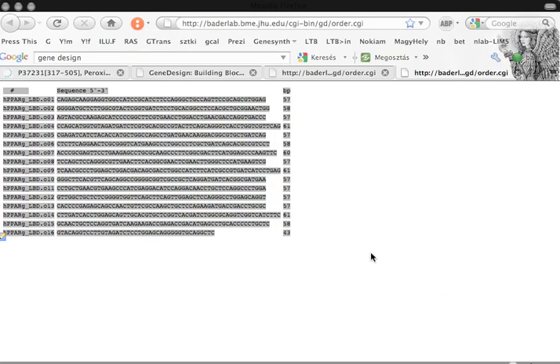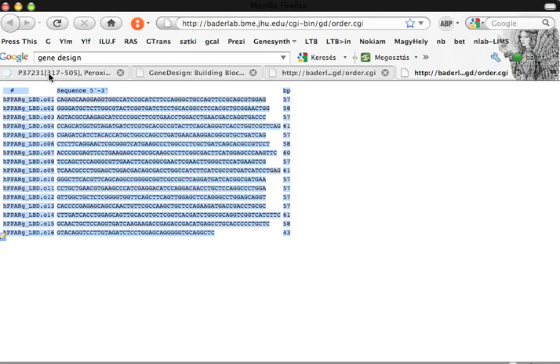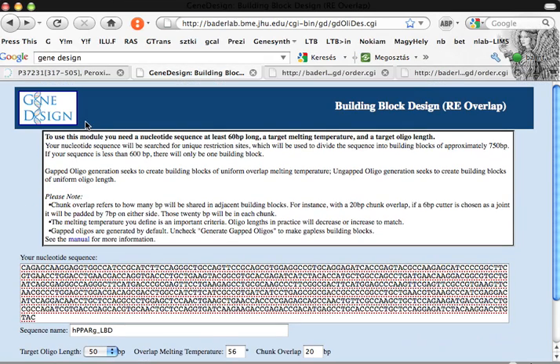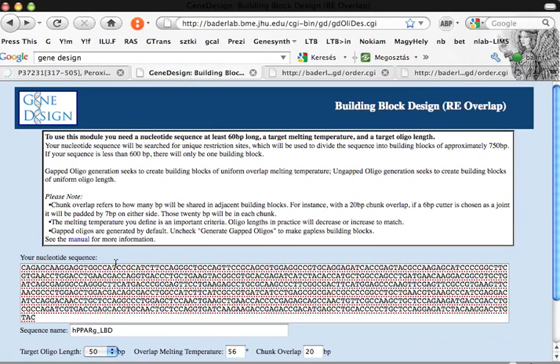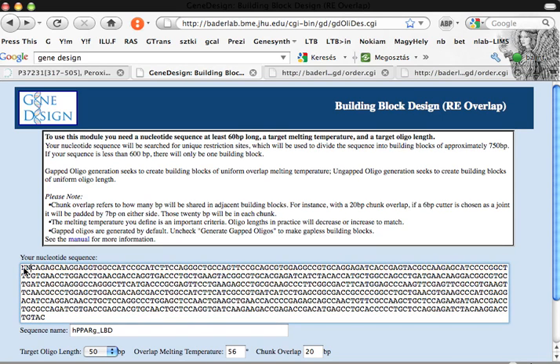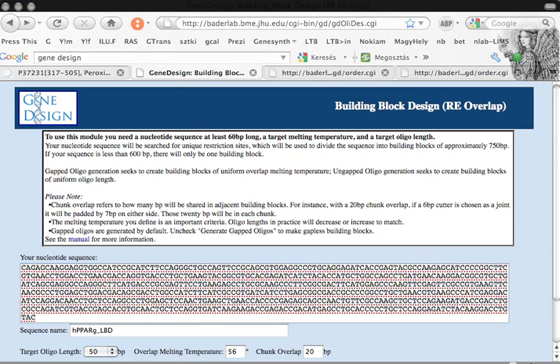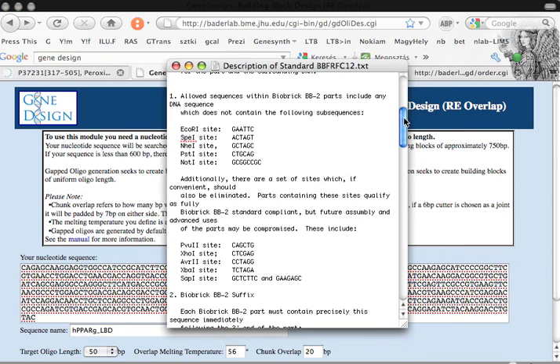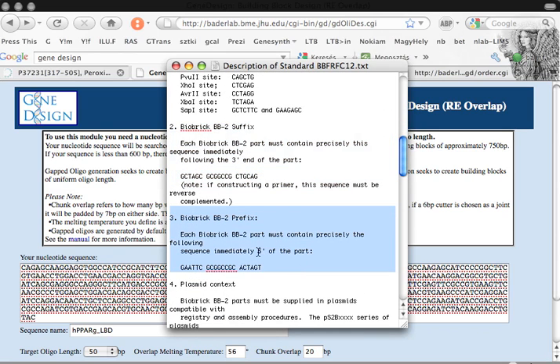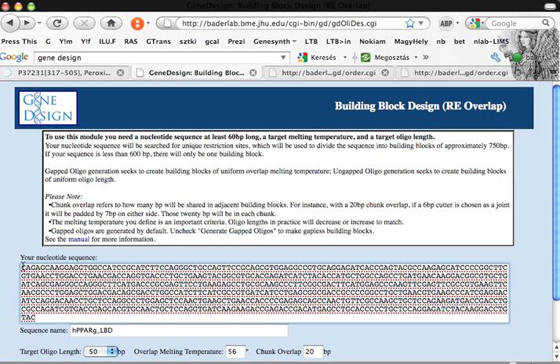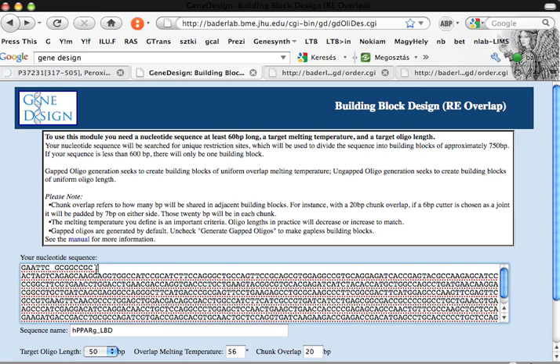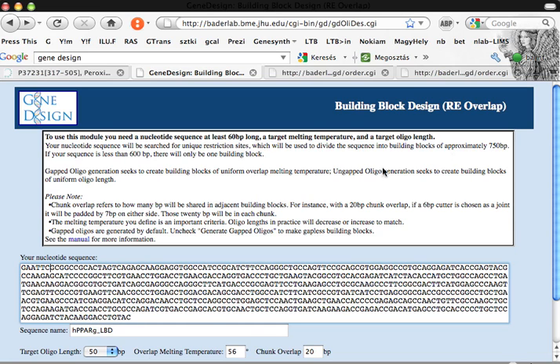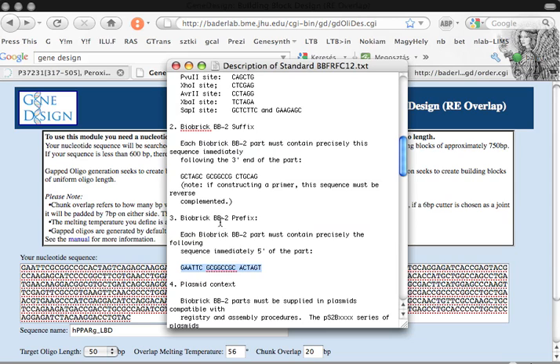Now we can go back and try to put the suffixes. I will see if we can insert here nucleotide. Yes we can. So let's go back to our standard and here in our standard you see that there is a suffix and the prefix. The five prime part has to contain this prefix. So let's insert this prefix. Take out the enters.